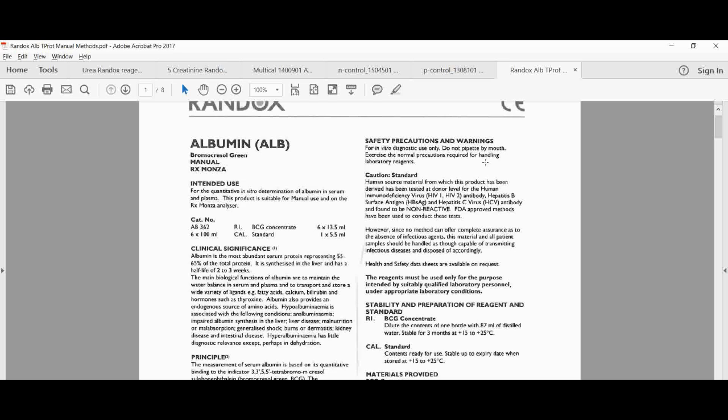Okay, I don't think people do that anymore because we don't use those big rod-like pipettes anymore. We use the automated pipettes that range from 200 microliter to 1000 microliter, and other pipettes where you have 10 microliter to 100 microliter.